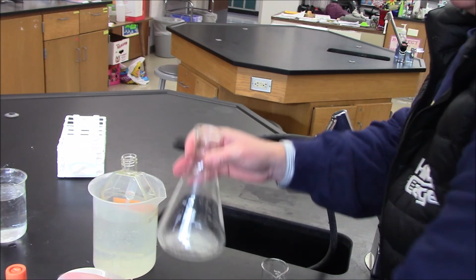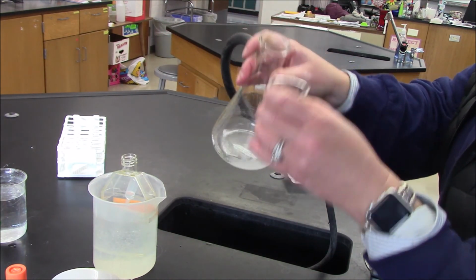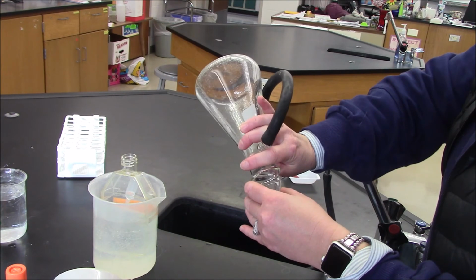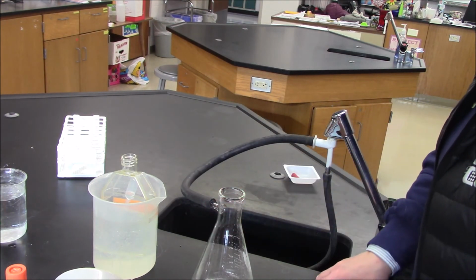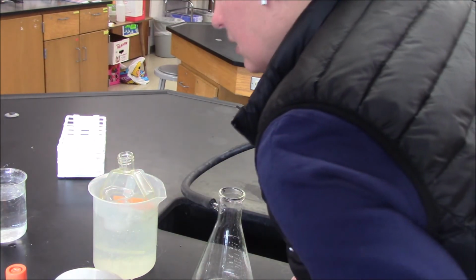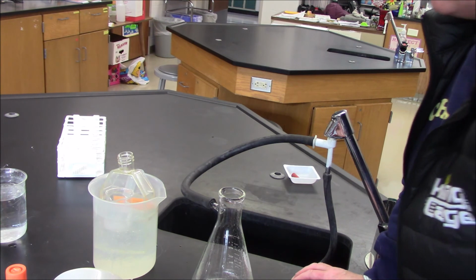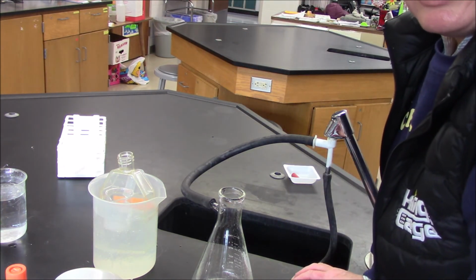Okay. You can see I still have stuff here. Looks like I have some solid in here. So what I'm going to do is sit this in the ice water bath for a little bit longer, and then I'll come back and filter this again.